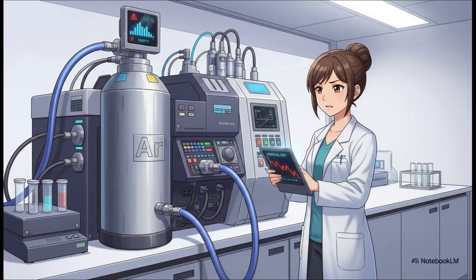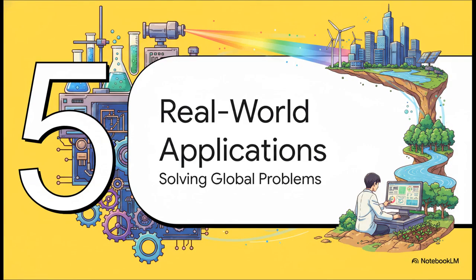We also have to be real about the practical limitations of AES. First off, the financial barrier is steep. A high-end ICP AES can easily run you up to $150,000. Second, that plasma is incredibly thirsty. It eats through about 15 liters of ultra-pure argon gas every single minute. That can cost a lab up to $15,000 a year just in gas. And finally, standard argon ICPs really struggle to detect certain nonmetals, like halogens, just because their excitation energies are way too high.